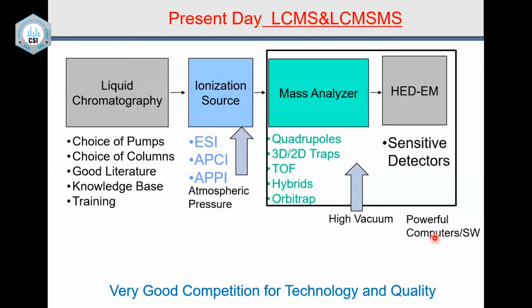The applications of LCMS have really widened, right from small molecules all the way to macromolecules such as proteins, peptides, and enzymes, etc. And if you see a mass spectrometry journal today, you will be surprised. There are more applications in biochemistry than in small molecules.